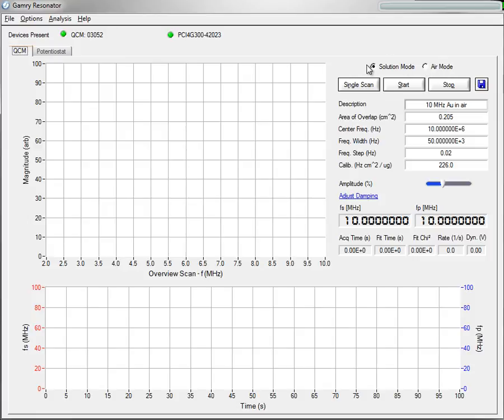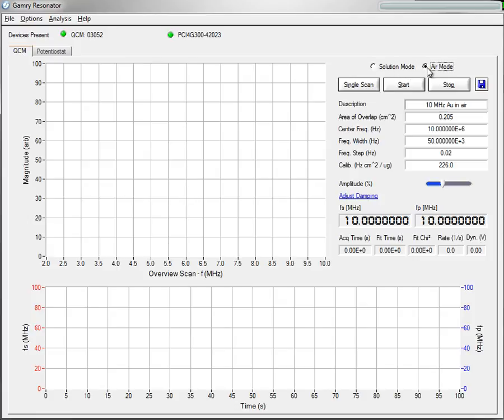When you first start Resonator, there are two new radio buttons at the top of the QCM panel. Whether you're running in Solution or running in Air Mode, you simply click on the correct radio button. The rest of the setup parameters are the same as they were before.